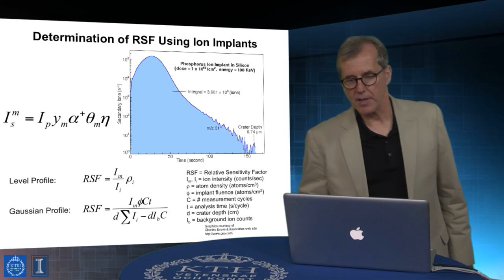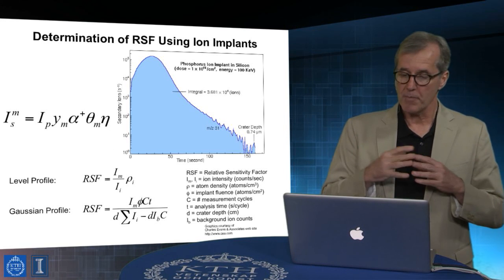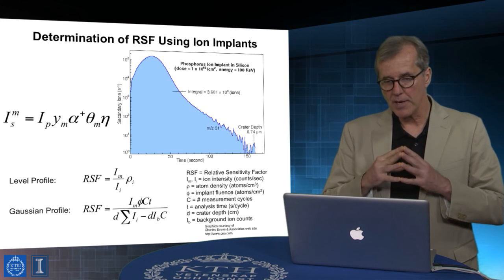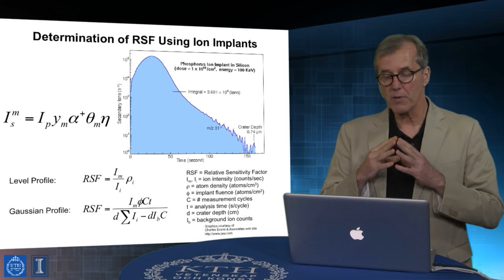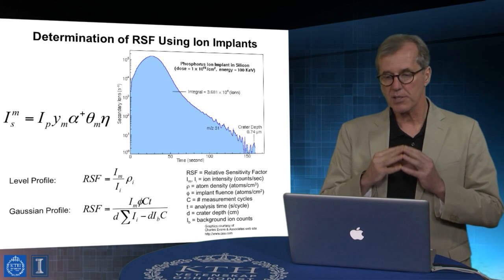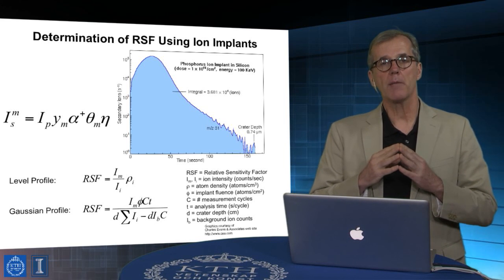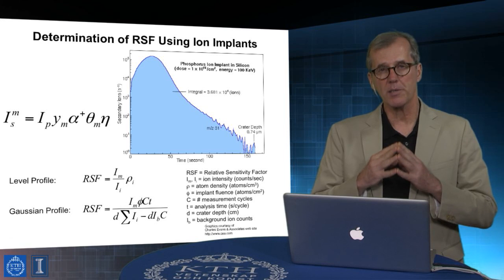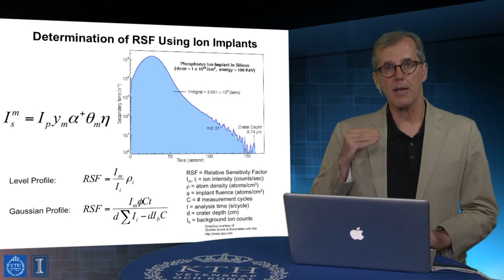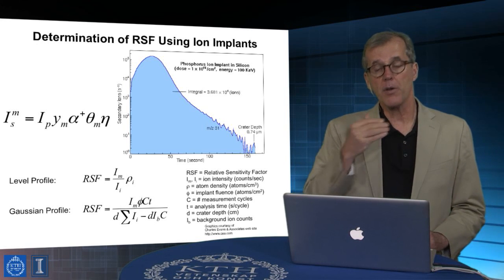Okay. And finally, I want to ask what are ways in which we can make the analytical measurements, other than just saying ion yields can vary by many orders of magnitude. In particular cases, there exist protocols for doing very high sensitivity calibrations. Let's look at the case of semiconductors as an explicit example. There are methods where you use highly precise ion beams to generate samples very similar to the cases you're trying to measure, but that have very precise compositional contents that allow you to then calibrate your unknown measurement.